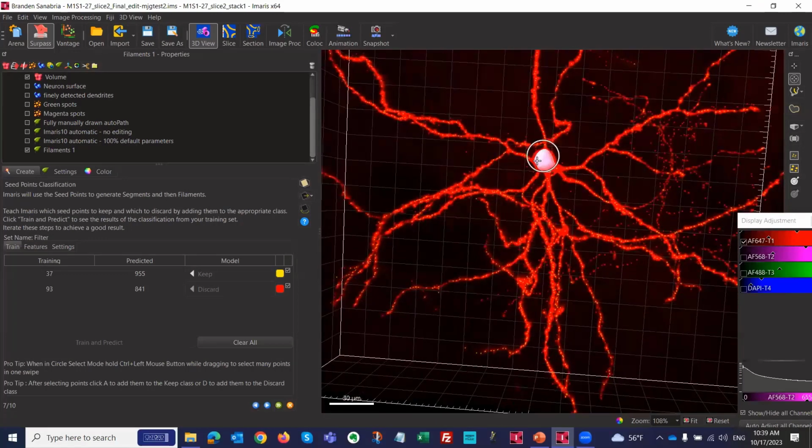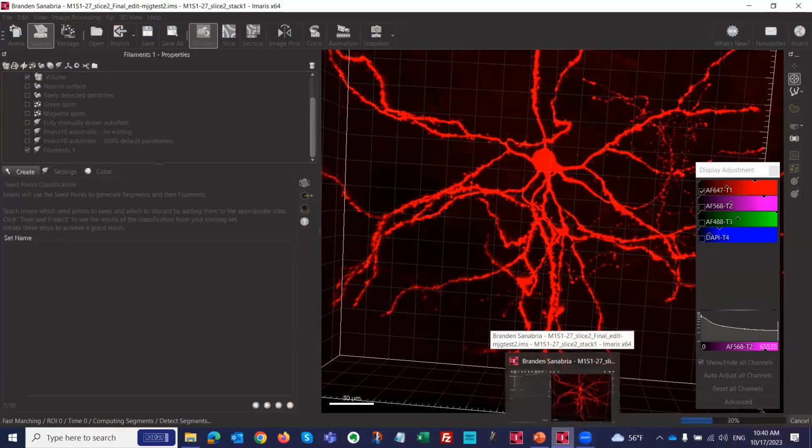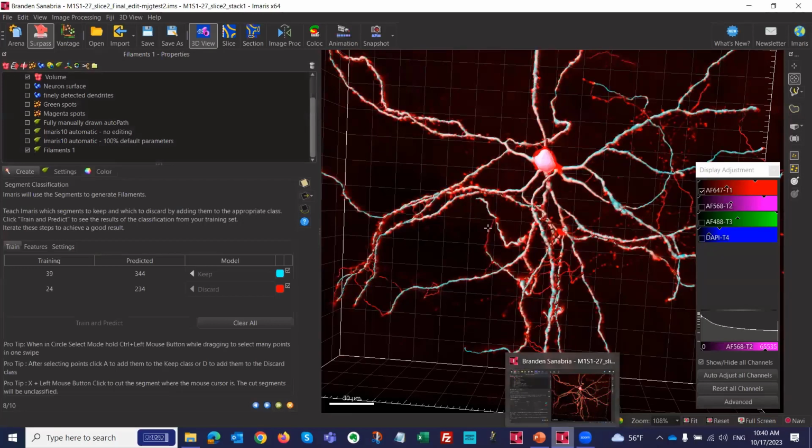So this is the first machine learning step. So I'm done, I'm happy. And I'm going to the next step, which is the second machine learning step. So this is also the most time-consuming step here. You can see, you follow the progress bar down here. This used to take a long time, and now it is much, much faster. And again, if you have a dedicated workstation, it will be even faster than for me on my laptop. Okay, so it's already done.